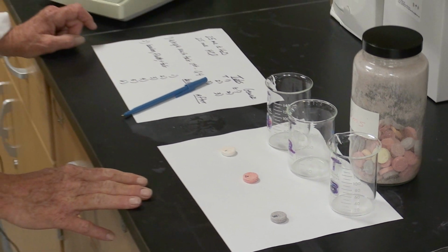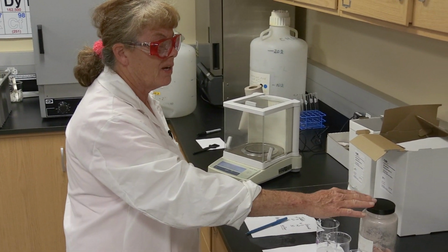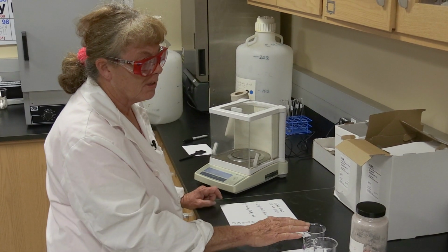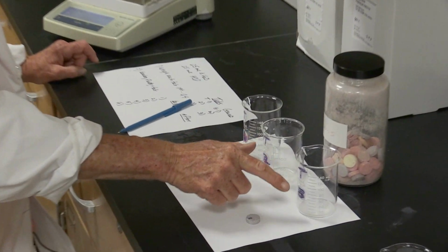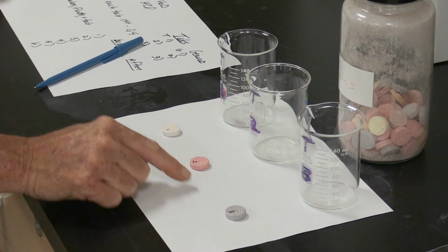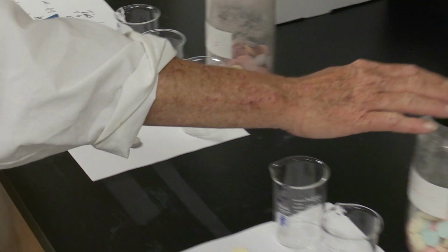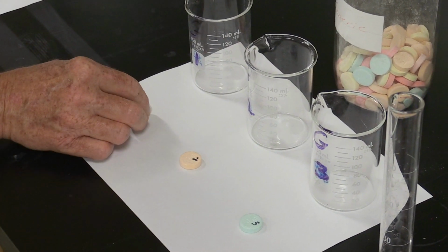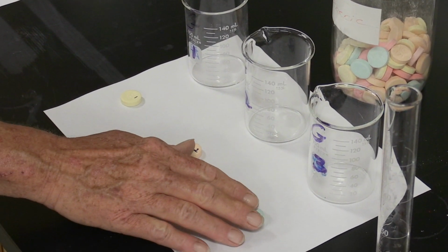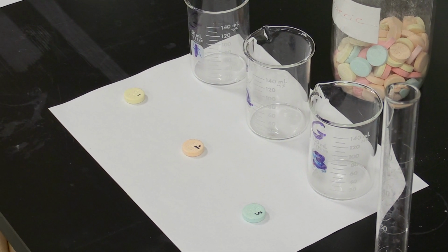Okay, anytime you do an experiment like this, the name of the game is to label everything. So I'm going to have Tums. I'm going to have 3 beakers. I labeled my beakers T1, T2, T3. I even labeled my tablets so I don't confuse when I'm weighing. We're going to take the generics. We have generic 1, generic 2, generic 3, generic tablet 1, 2, and 3. The first step we're going to do is to individually weigh each tablet. So let's start doing that.